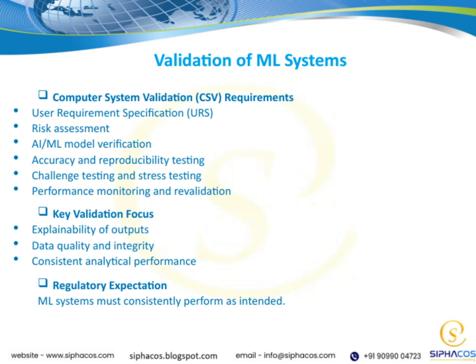From a regulatory perspective, the expectation is clear. ML systems must perform as intended, reliably delivering accurate and consistent results. This is essential to ensure safety, effectiveness, and compliance in our regulated environments. As we integrate ML into our processes, these validation principles help us uphold quality and trust throughout the life cycle of these systems.